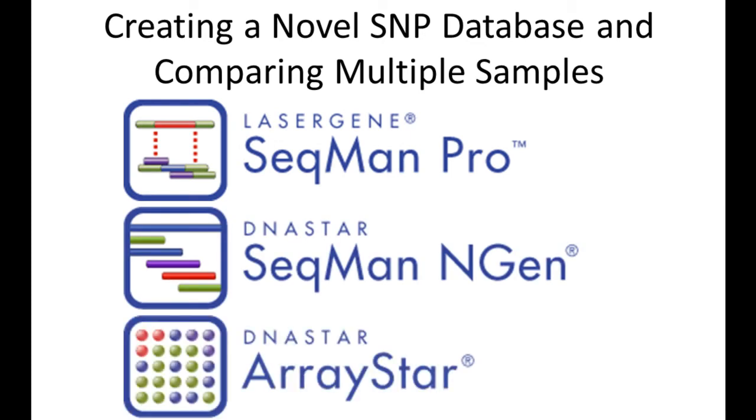We will want to create the novel SNP database when we wish to compare novel SNPs along with dbSNPs. We want to know which exomes have SNPs and which do not at certain locations.